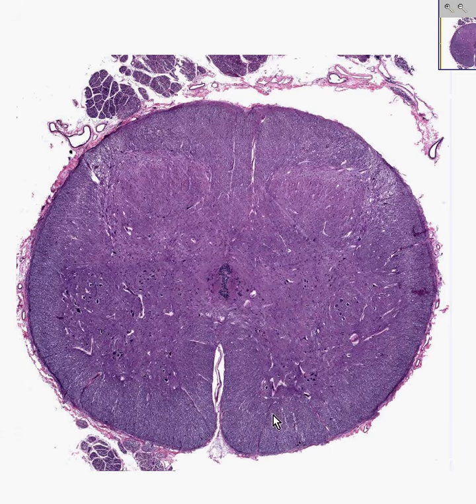The white matter of the spinal cord are chiefly various tracts that either go to the brain or come from the brain. In other words, ascending or descending. And the central portion of the spinal cord looks like it has a little hole lined by epithelium, but in reality, this is a central canal, and it is lined by ependymal cells, which is the only type of glial cell we have not identified yet.